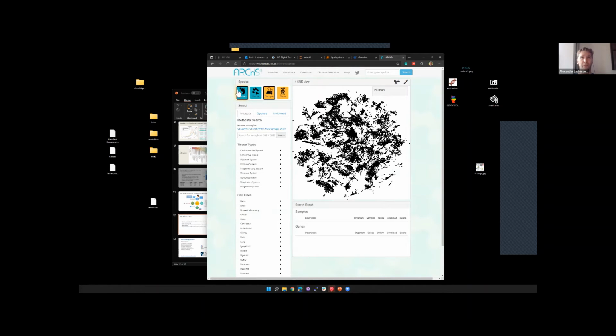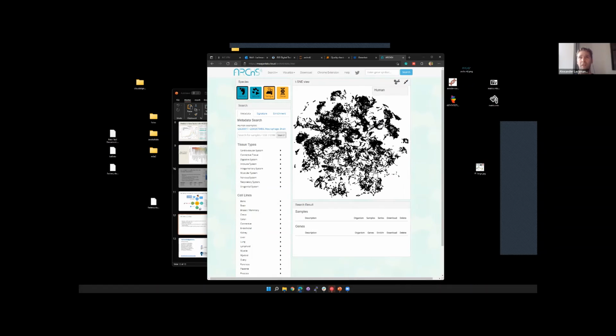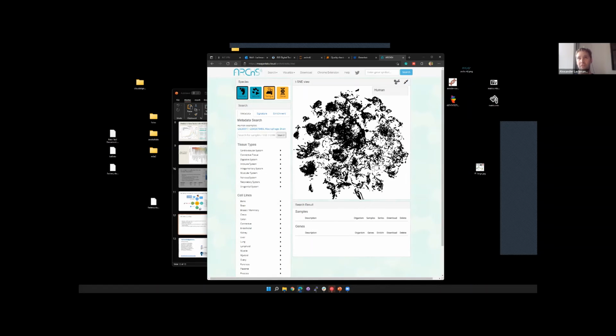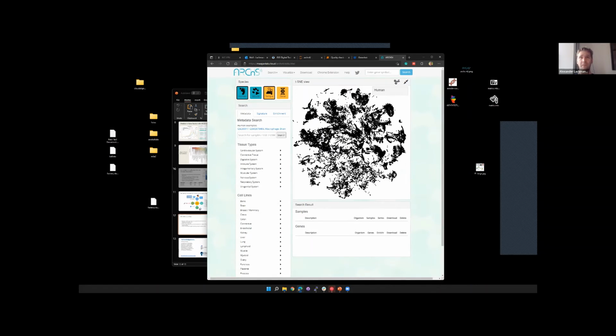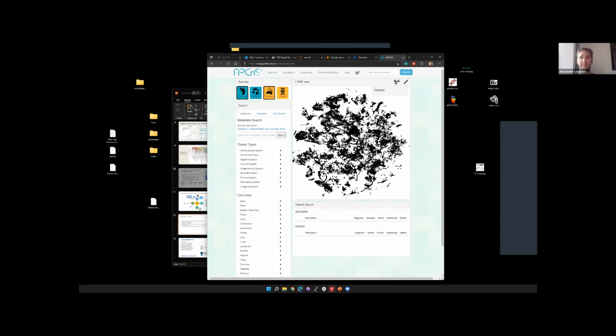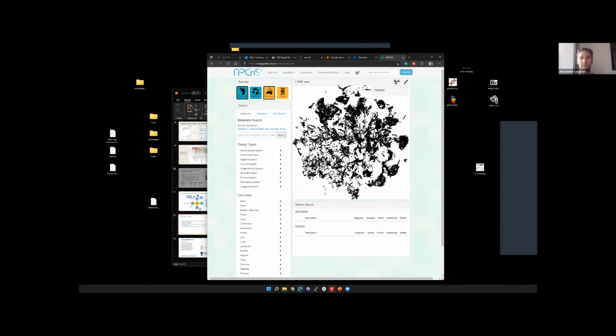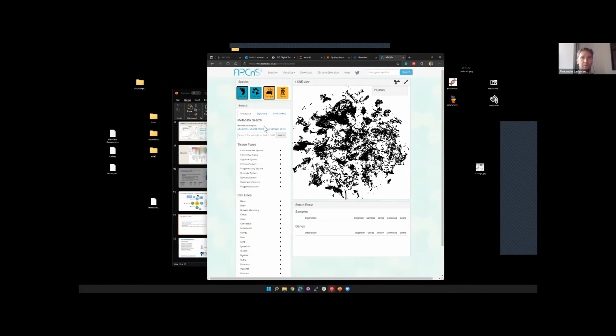But getting started, this is the main page for the data view. Here we have human data selected, and we're looking at the samples. This is a 3-dimensional representation of all the samples. Each point is an individual sample, and this is a t-SNE projection of that data. You can see that the data is quite structured, and that's, I guess, what we want to see.